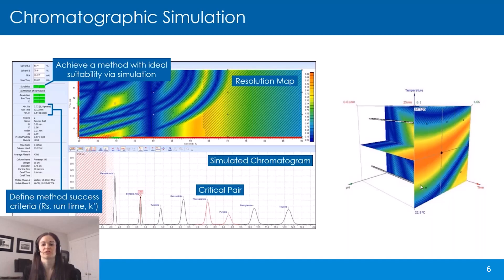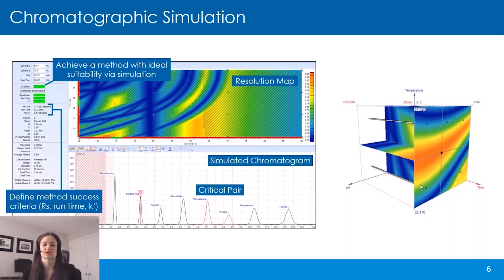Jumping forward a little — you've determined a possible method to start with, including which columns, pH, and buffer to use. The system suggests the experiments for you to run, and now you're ready to think about robustness. One way to visualize the robustness of your method without actually running a large series of experiments is to use chromatographic simulation for your separations, looking at your entire design space. This allows you to predict the impact of adjusting method conditions such as pH, temperature, and gradient, as well as solvent ratio against your success criteria — things like runtime, retention factor, or resolution — without performing countless experiments. This means you can create a method where a small change in temperature or gradient, which can happen when you transfer methods between labs or different instruments, won't dramatically influence the quality of the separation.